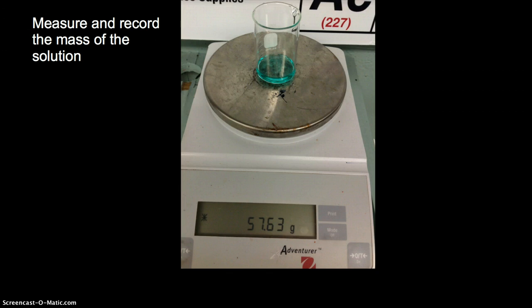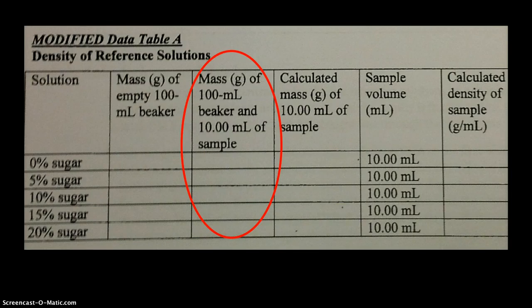Once you have 10 milliliters of liquid, which will be indicated by the 0 milliliter mark, allow the liquid to drain into the receiving beaker, which is the 100 milliliter beaker. Measure and record the mass of the solution once you have placed the 10 milliliters of liquid into your beaker. This should be done at your lab bench, and then the beaker should be walked over to the balance. Record the mass of the beaker with the sample in it in this column of your data table.